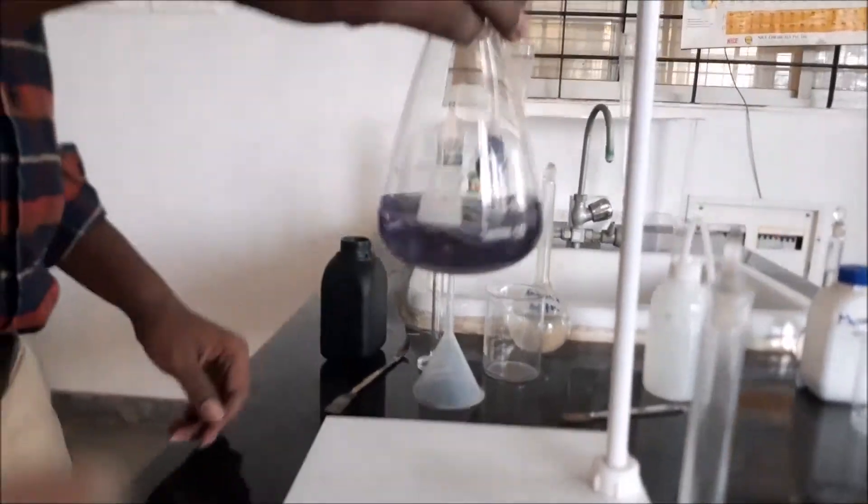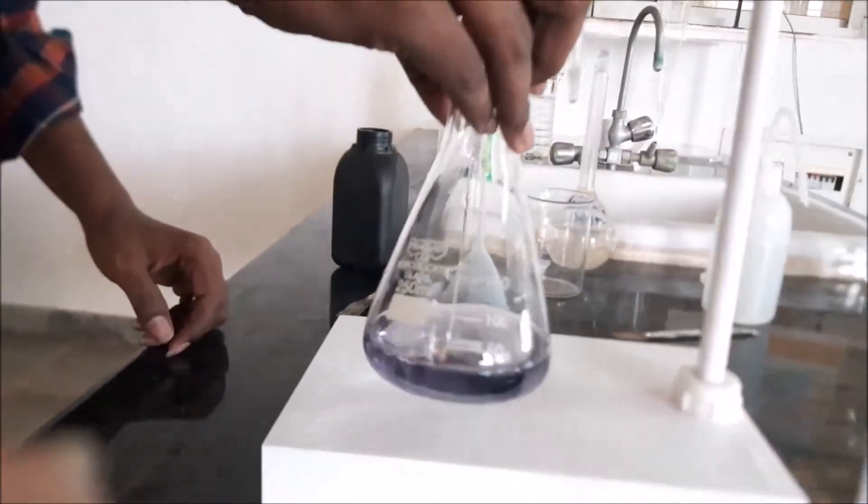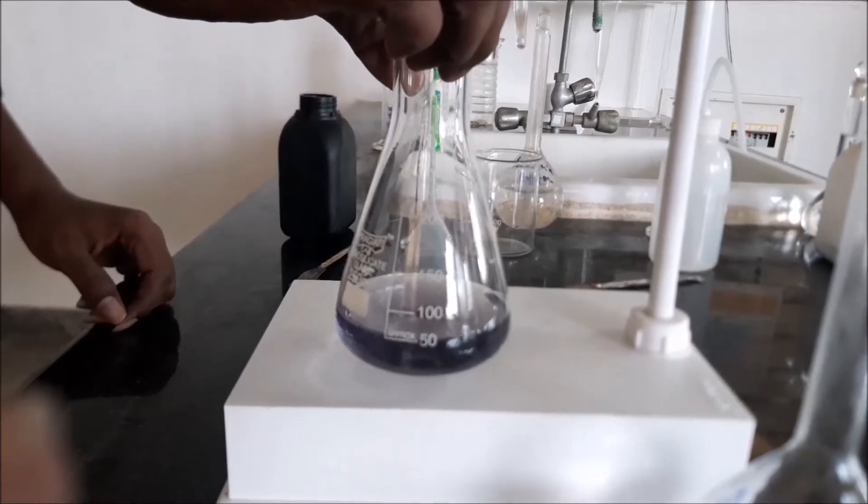Yes, as you can see, it has now turned to permanent blue colour, which indicates that total hardness is present.